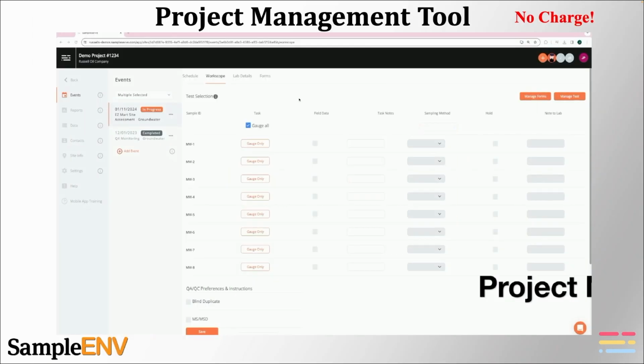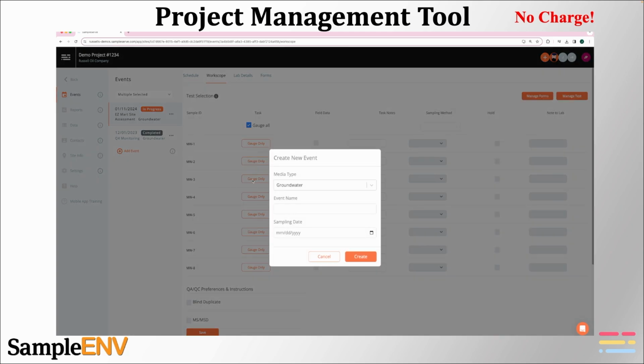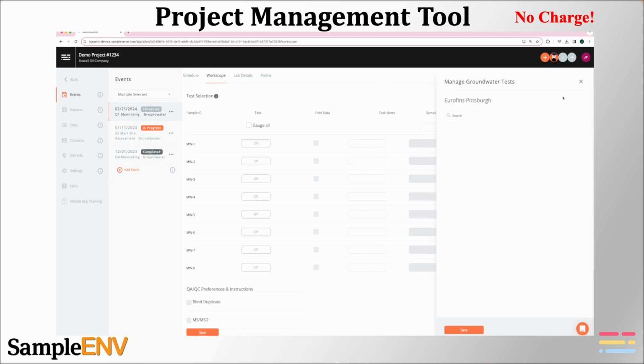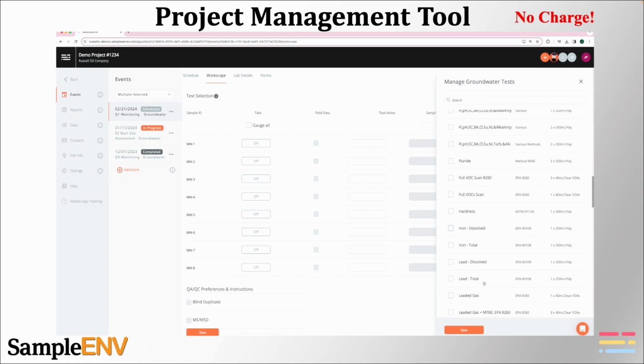This video of our project management tool demonstrates that it's mostly point and click. Users select the sampling media as there are different tests for different media. They then give the event a name, for instance, Q1 monitoring. They then pick the day they want to sample, and they can even pick the person they want to assign to that sampling event. Then you're going to select your analytical parameters using the Manage Test button to pick from the selected laboratories menu for certain analytical parameters.